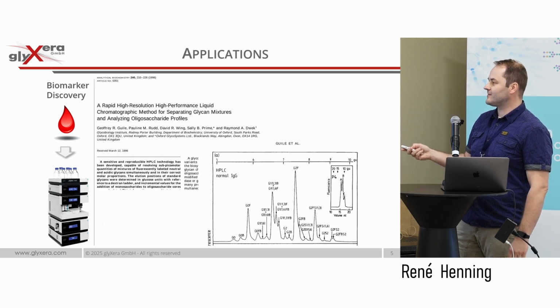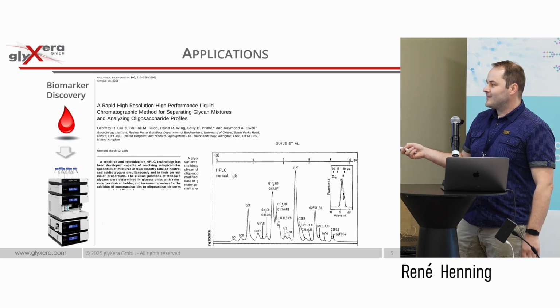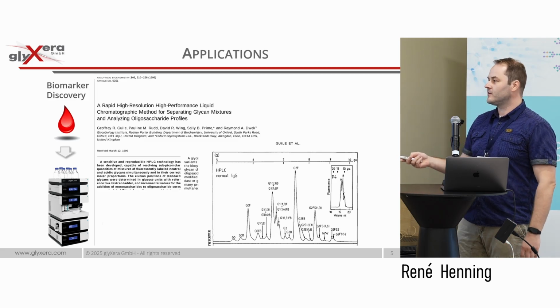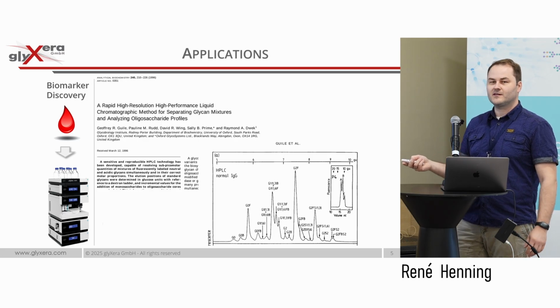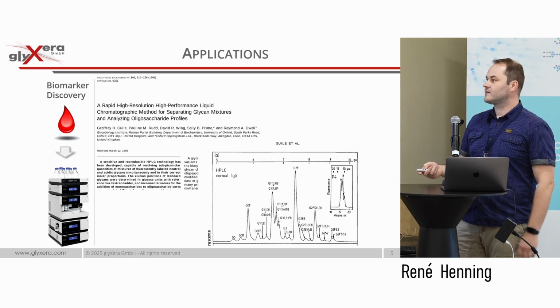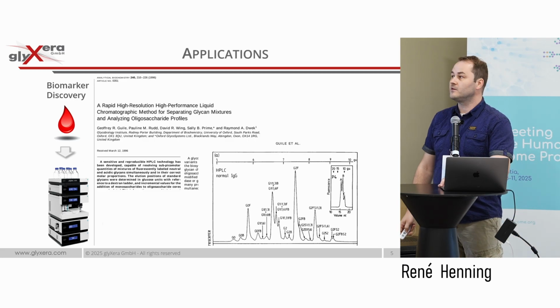They had a database and they annotated it. So actually, they have done it already before. This is still a not so nicely looking chromatogram, but they improved in the past, so now the resolution is also quite nice. I only wanted to point out a lot of development was already done in the past, and Gordon and others, who measured the big cohorts, did the basic work which was necessary: the annotation of these peaks to be able to measure all these big cohorts.